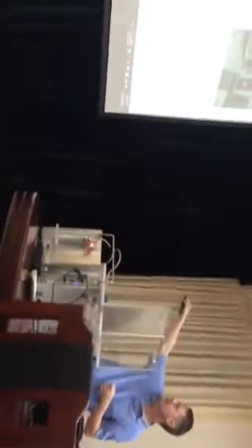Okay, so I was going to show you some applications for C4D. This was measuring anions and cations in drinking water. This was done by a group in Romania. So this is their instrument here with the EDAC C4D. These are the working conditions.